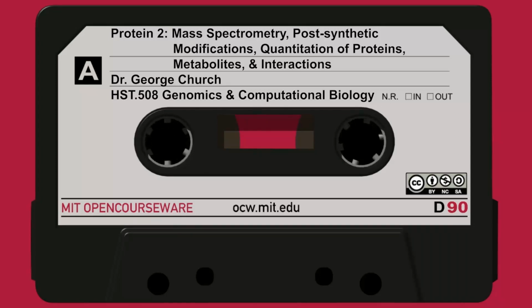And so, as it turns out, just empirically, if you sort through all the chemistry, it is, in most cases, the peptide bond that is most actively cleaved, and so the B ions and their complementary Y ions dominate the picture. Now, the other ones will be present, especially if they come from a very abundant peptide. They can swamp out the B and Y ions for a less abundant peptide. But all other things being equal, the B and Y will dominate, and most of the rest of the discussion will be about those. Okay.